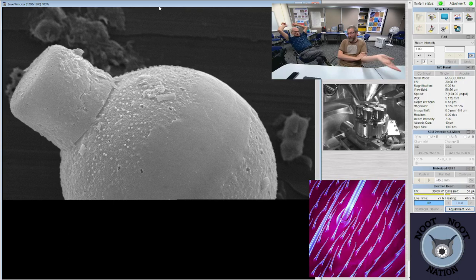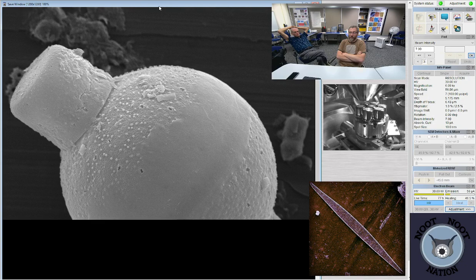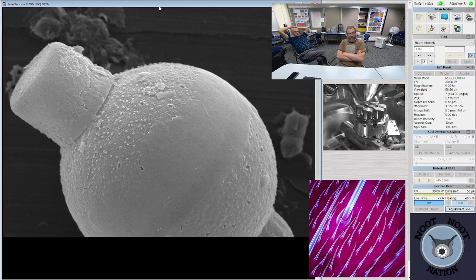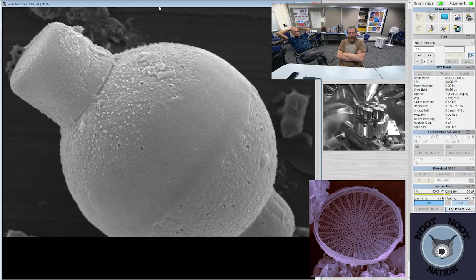Could you use something like that? Could I use it? Yeah, one with a laser, obviously 3D images and elemental analysis. I mean, it sounds nice. You have a couple million you want to just throw around? The thing is, though, it requires a technician. If you're going to get a $1 million instrument, you might as well also get a technician. Yeah.